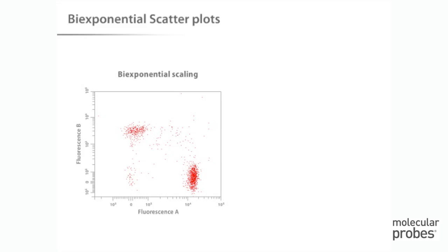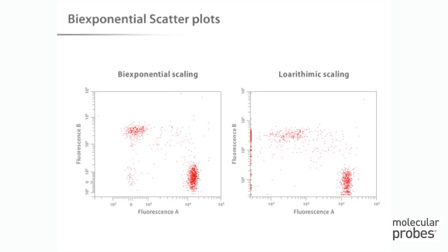Many of the plots shown in this tutorial use what is called a bi-exponential scale. This scale transitions from logarithmic scaling at the upper end to linear scaling at the lower end. Bi-exponential plots have become more common with the growing number of digital flow cytometers that have electronics which might assign fluorescence values that are below zero. These data may not display properly using standard logarithmic scaling, although calculated statistics will be correct.